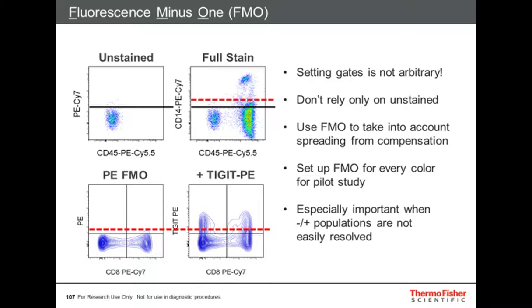And you want to move the gate up, but you certainly can't convince a reviewer that Carol said I could move the gate up. Unfortunately, that doesn't get a paper into a journal. I wish it did. But if you run the FMO, you can see that that gate definitely defines the population and describes that spillover spread that we see there.